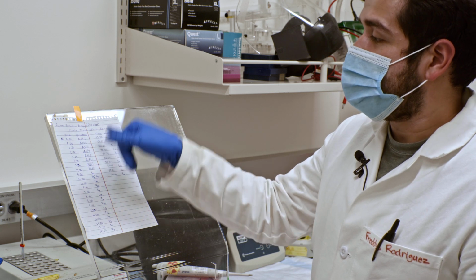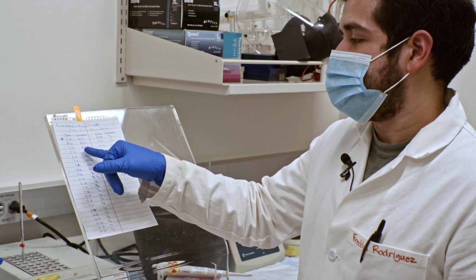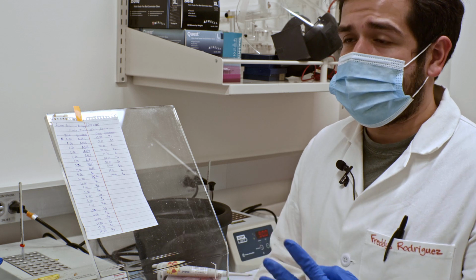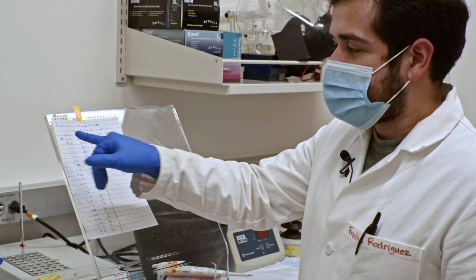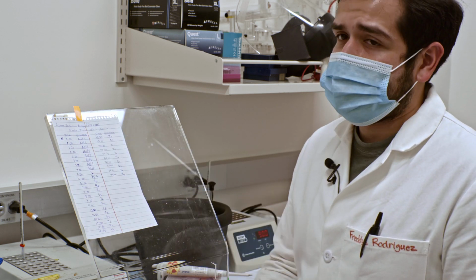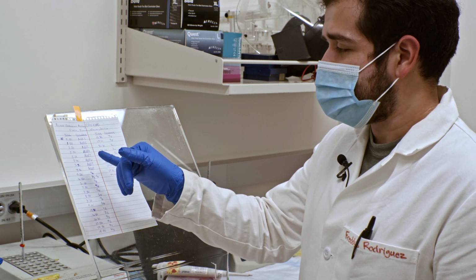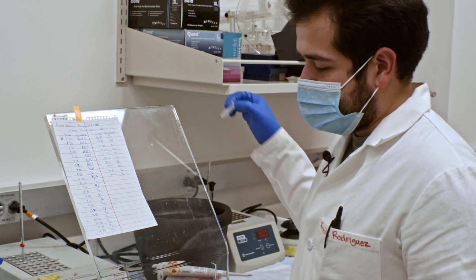And since I'm giving myself 30 seconds to do each of these things, that means at minute 1, I'm adding dNTPs to reaction vessel 2. At minute 1:30, I'm adding it to 3. At minute 2, I'm adding it to 4, and so on and so forth, up until I get to the last reaction vessel, which is 8 at 4 minutes. So then, if you do the math, since I started the reaction in reaction vessel 1 at 30 seconds, and I'm trying to take a 5-minute aliquot, that means at 5 minutes and 30 seconds, I'm going to get my first aliquot of reaction vessel 1 from the heat block and put it into one of my reaction vessels in order to quench that.